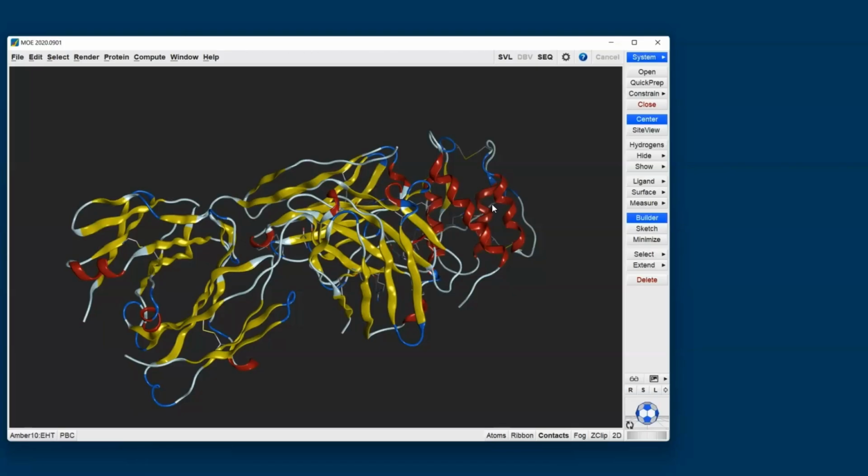So in the next steps, what we're going to be doing is analysing this structure that has poor solution behaviour and make an attempt to reduce the hydrophobic patches whilst maintaining affinity. But before we can get started on that, given that this is a PDB file, we first need to prepare that PDB file ready for modelling.